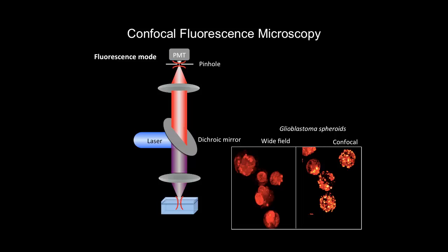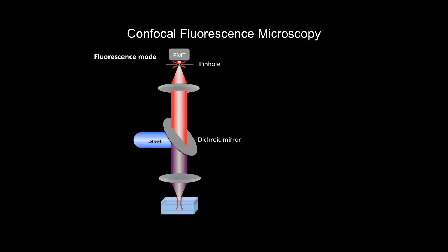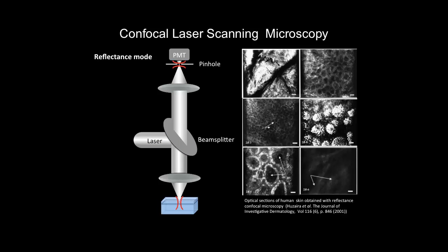Yes. I have a question, not about fluorescence microscopy, but just the simple reflectance. I'm wondering about the efficiency of throughput in this system, because your reflected light is at the same wavelength as your excitation, so I would assume if it's a standard beam splitter, you lose 50% going down, and you lose another 50% of the reflected light going back. Is that true? Yes, that's true.